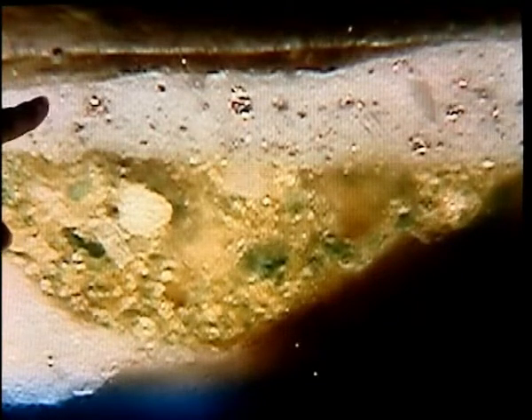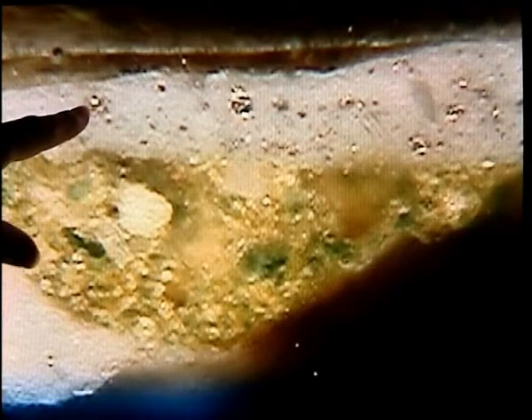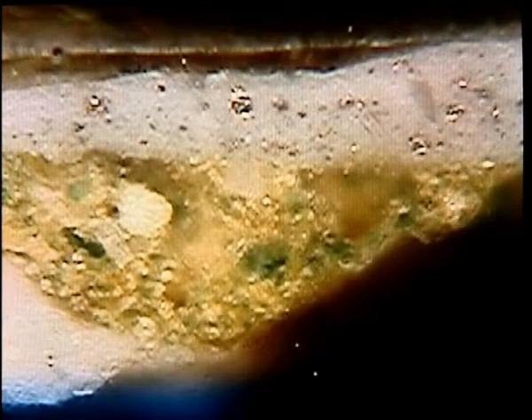And we can see immediately that Raphael changed his mind during the painting. We can also see the separate pigment particles within the paint layers, so we can see what mixtures Raphael used. In the grey paint, there is a mixture of a white pigment with another pigment which looks like tiny particles of metal. But in order to identify that pigment, we're going to need to do some more sophisticated analysis.